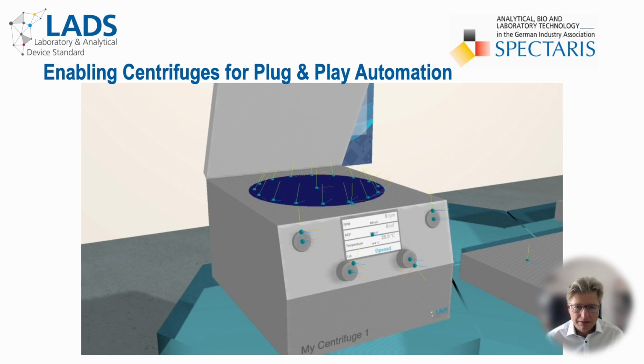While the incubator we have just inspected is one of the few lab devices designed with automation in mind, we will now turn to another typical lab device which is designed for manual operation: a laboratory centrifuge, one of the most common laboratory instruments. Its lid is currently opened, exposing its rotor. The green attachment points define the positions where labware should be placed.